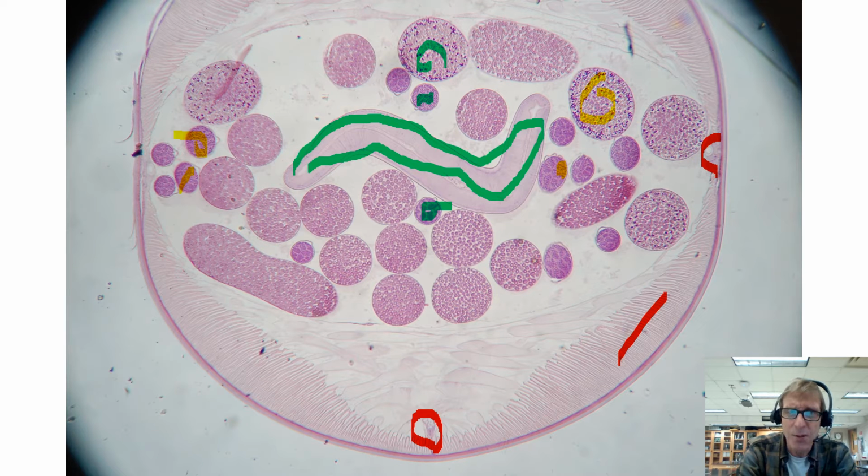So they're called a pseudocoelom because it is still a body cavity. It's not solid, but both sides aren't lined with mesoderm. That makes it a pseudocoelom. I think that's all you need with this one.